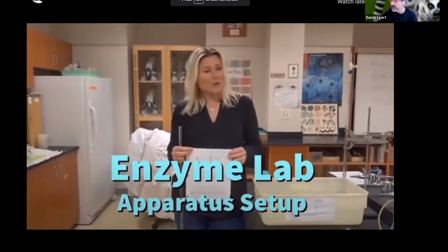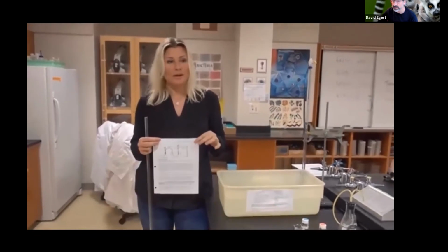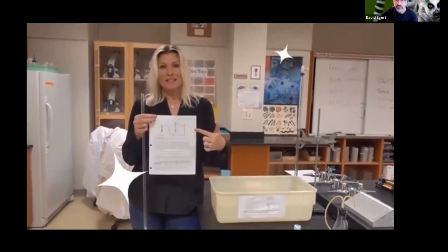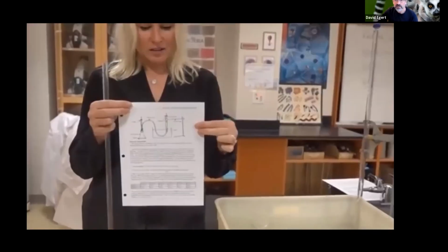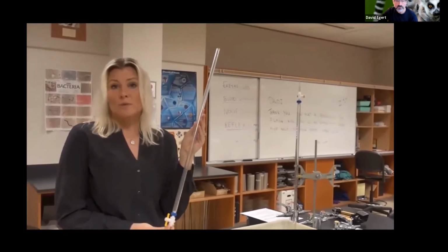All right, so what I have set up here is the complete setup for how we're going to do this enzyme lab. There are schematics in your lab manual. Just to go over some of these components, let's take a look at this interesting tube, which is actually just a regular burette.